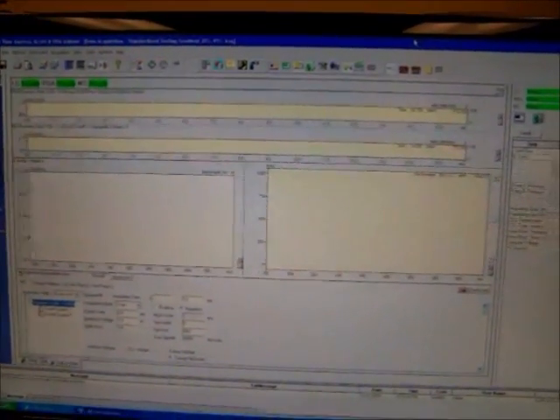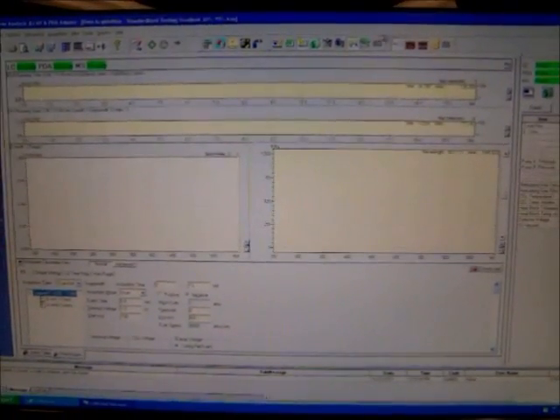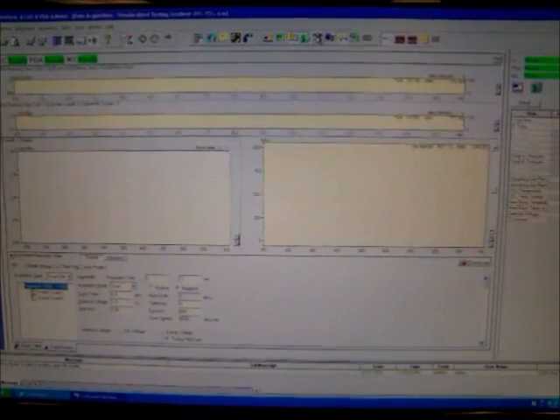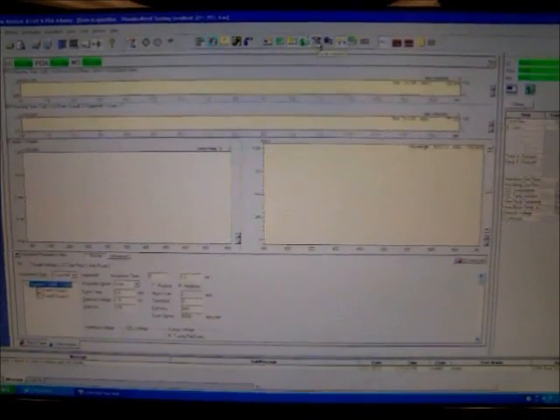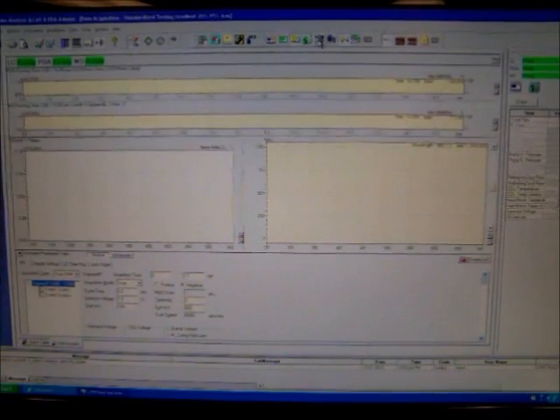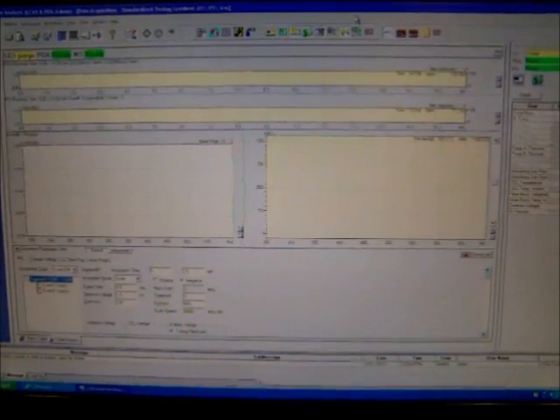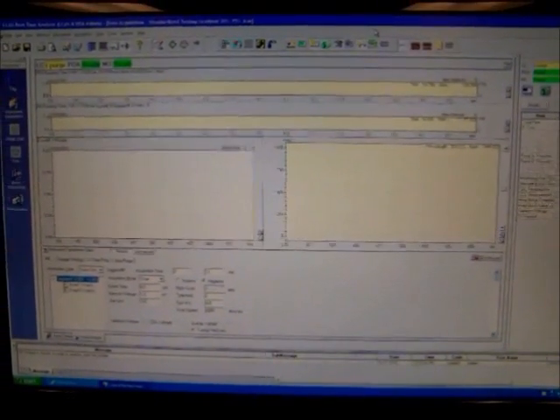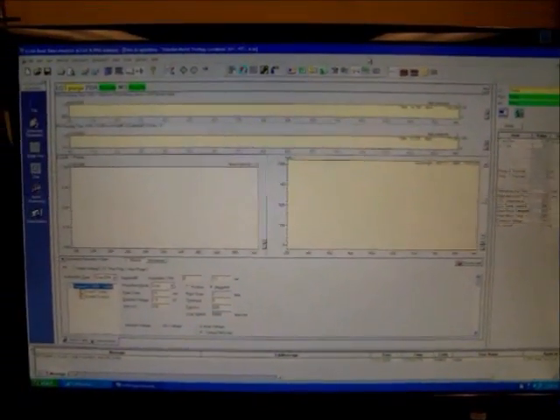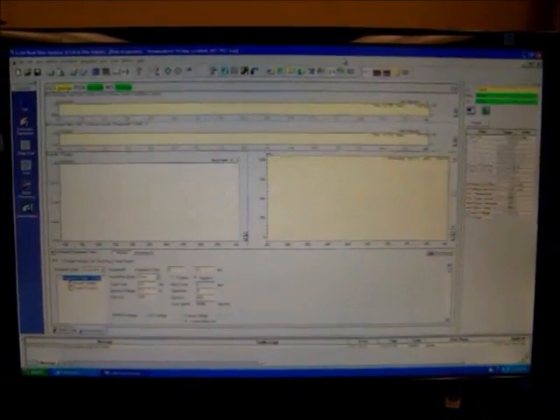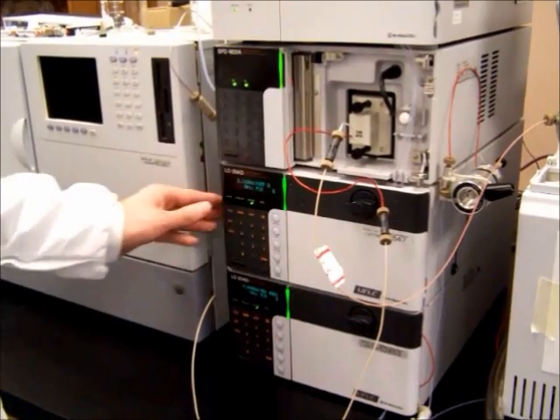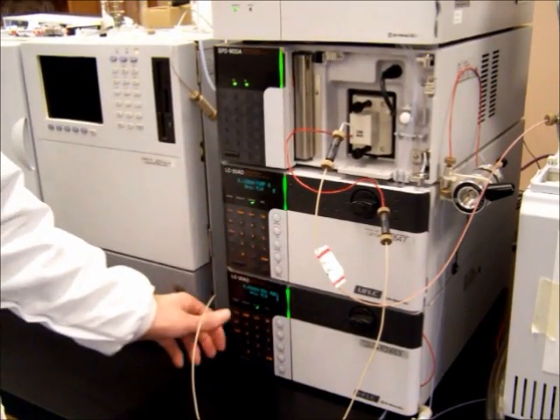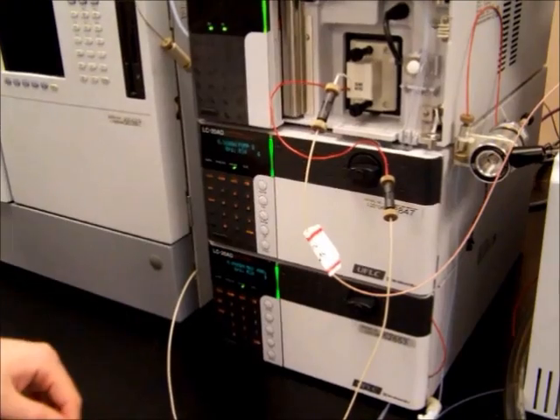So going back to the computer screen, the next thing we need to do is to purge the autosampler. To purge the autosampler, select this icon and press it. Depending on the method currently loaded into the machine, that will determine how long the purge the autosampler will take. A typical purge time is usually about five minutes and the autosampler will be purged and ready to go. Following the purge, the pumps will be seen to have shut off. When that happens, we're ready to move on to the next step.